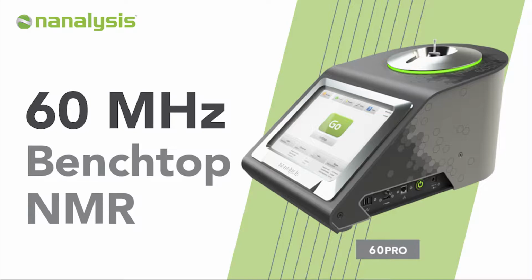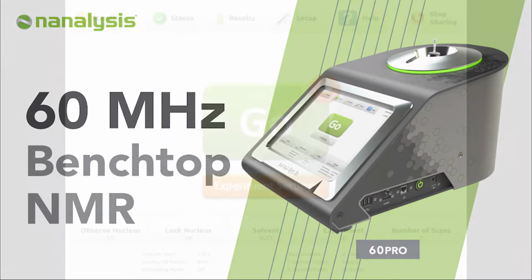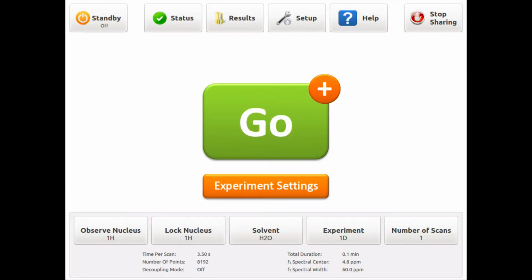Today, I will show you how to set up and run a T2 CPMG experiment on our 60 MHz instrument. In this example, I will show you how to determine the T2 time of a water sample doped with a relaxation agent. To run a CPMG experiment, the first thing you're going to want to do is run a regular 1D. This 1D experiment is used to adjust the gain, phase, and baseline, as well as to select the signal of interest of which you want the T2 time.